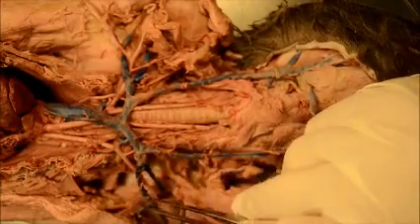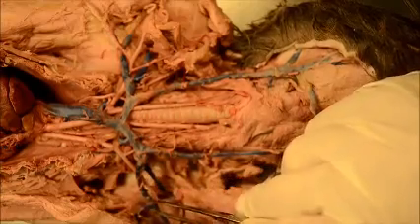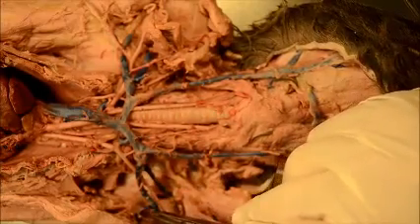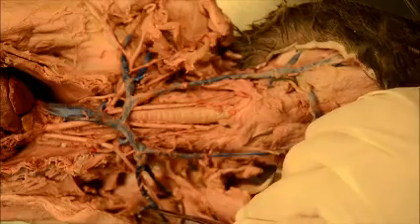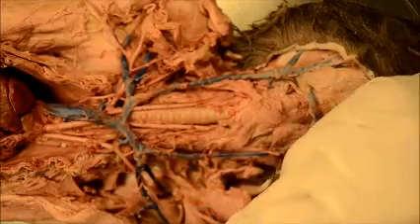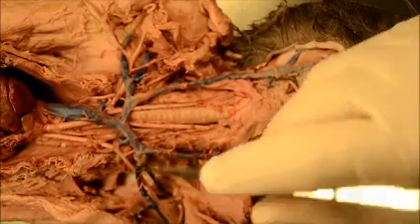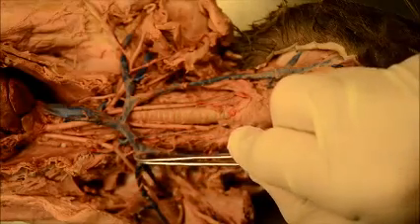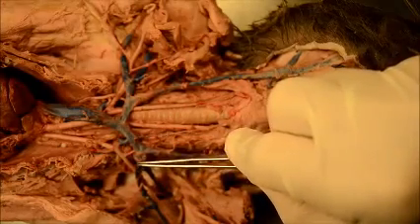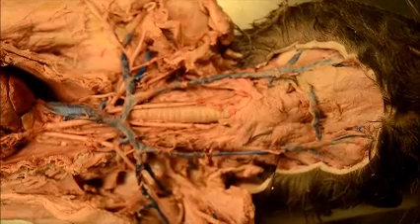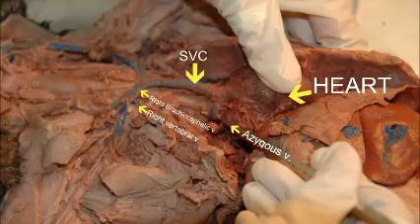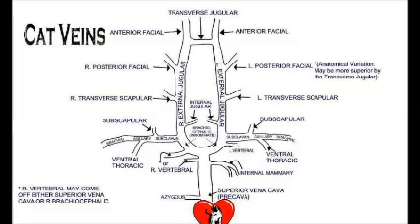Then after that is axillary, and another vein goes there — so that's the ventral thoracic. I wanted to repeat that because a lot of people get confused by that one area. Here is the azygous vein, which I did include in the video and a map that you can reference and pause at any time.